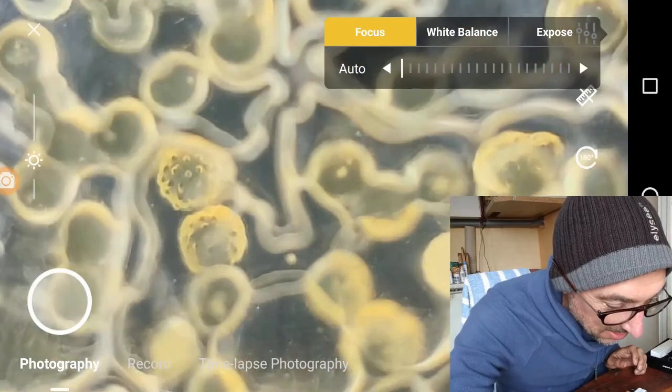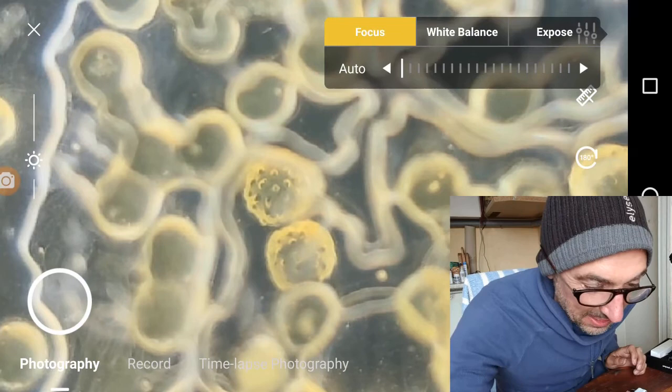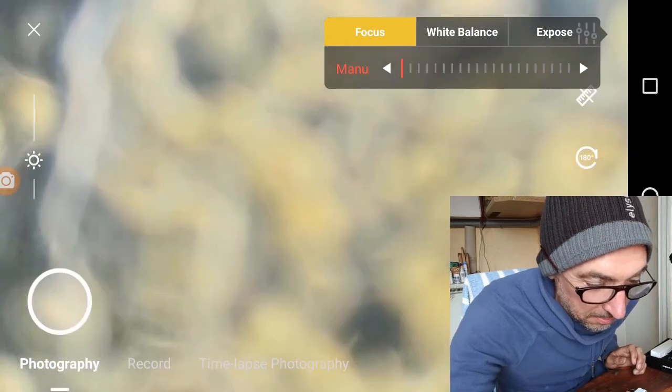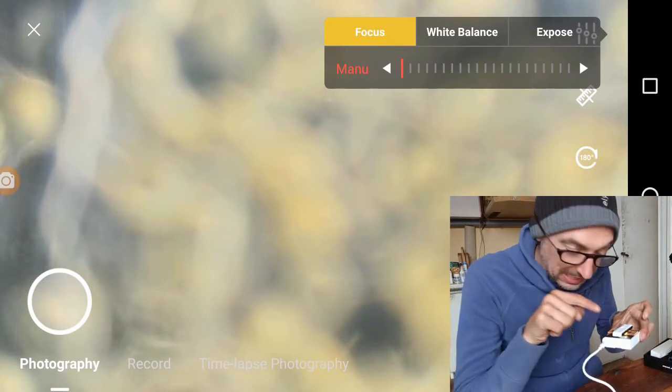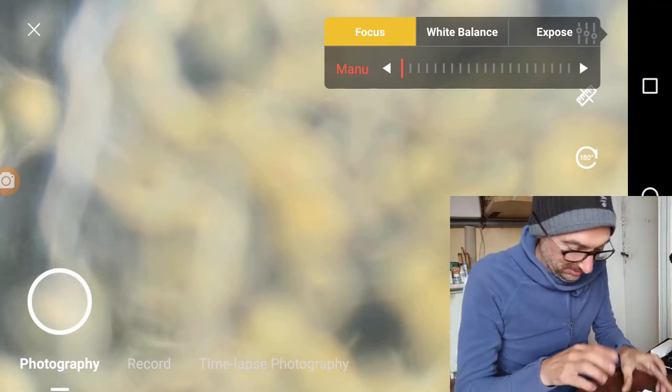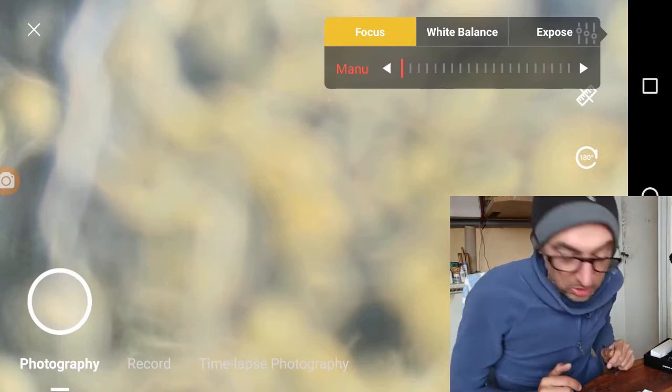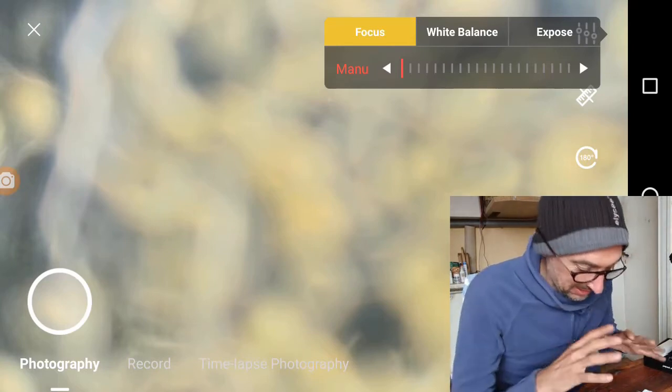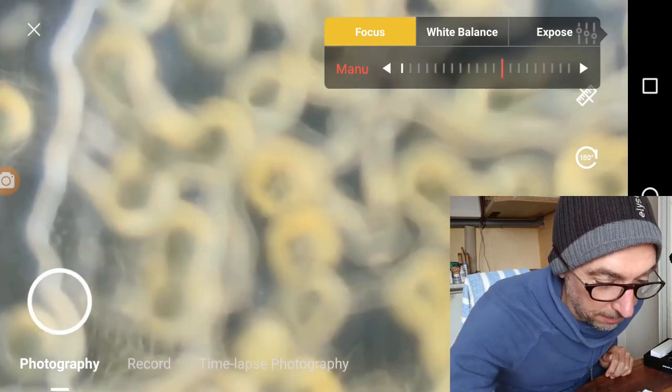Here you can see these little spikes. If you do setting changes here, it clicks inside - I don't know what this click means, but it's not just a cheap Chinese webcam. There's some mechanical part inside as well.